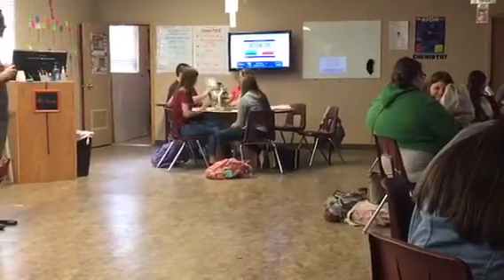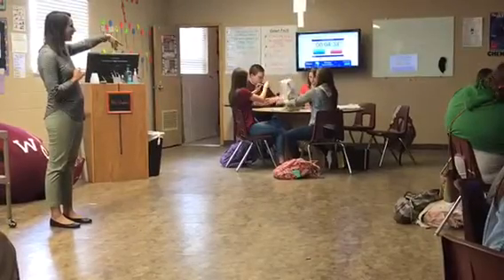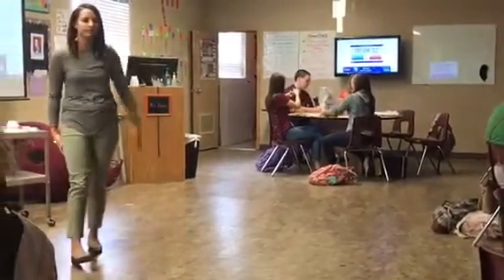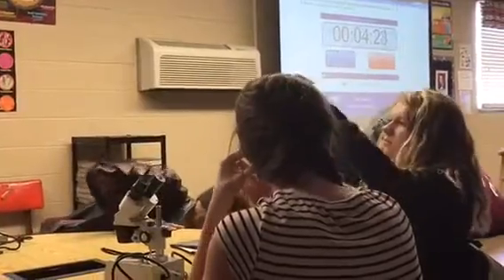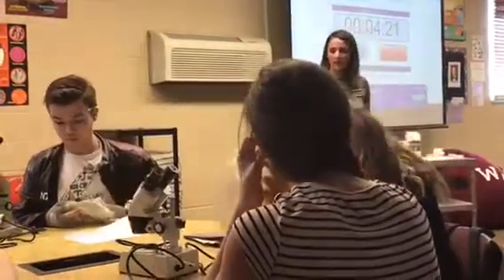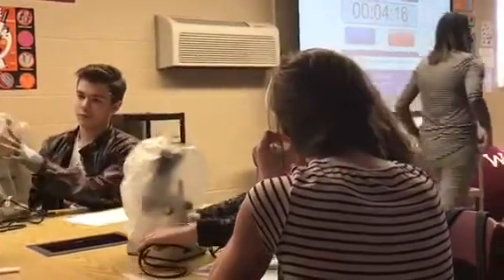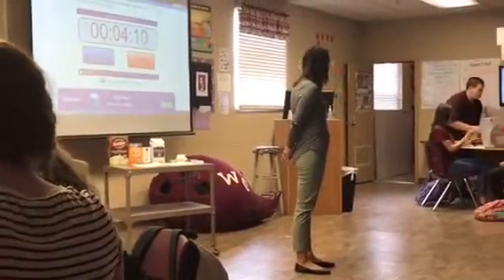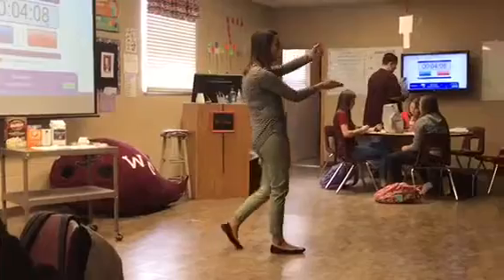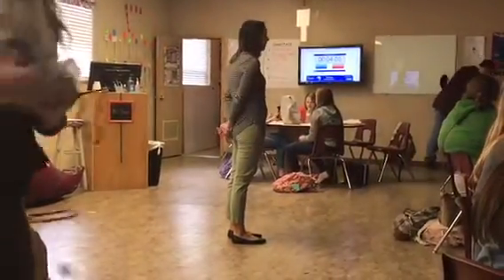One person from each group, you can put your microscopes away. If you're still working, continue to work. Here's the cover, and you can put it away. So table one, you guys can go ahead. Make sure you carry it by the arm and under the base to carry it properly. We don't break them.